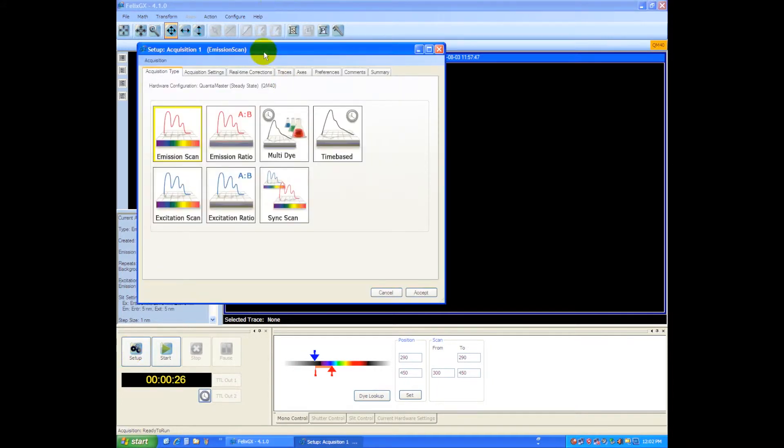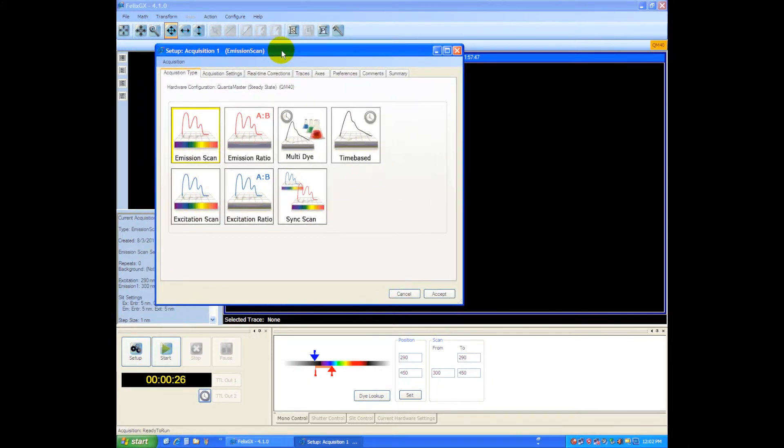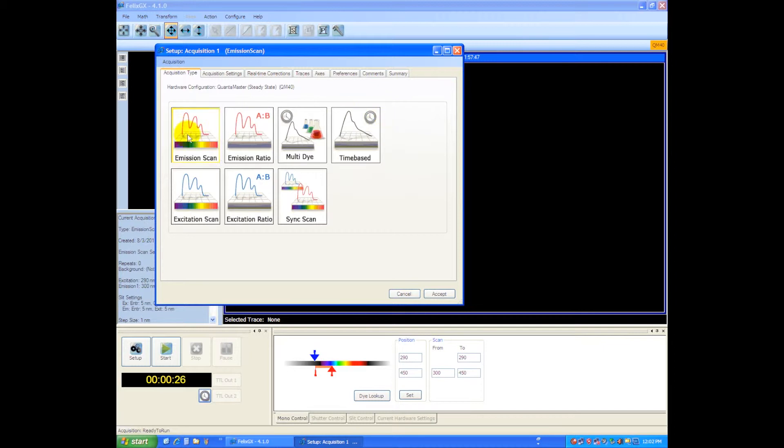There we go, and now we've got the setup dialog box. You can see here we have seven types of different scans that this instrument can do. This box is somewhat intelligent, so depending on how your hardware is configured, the various scan modes will show or they will not show.